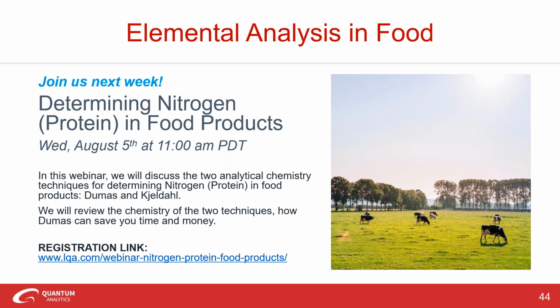Awesome. Next question, can XRF be used to analyze trace metals in aqueous samples?